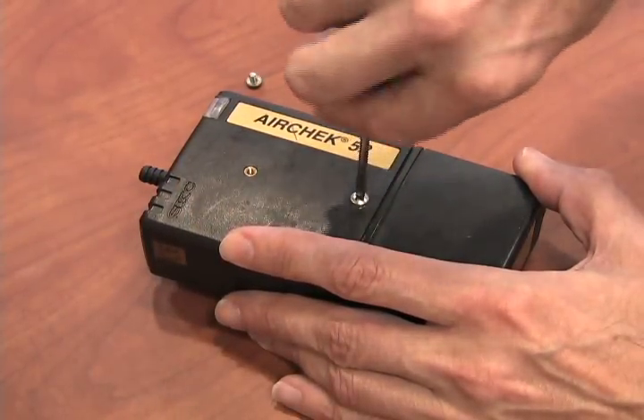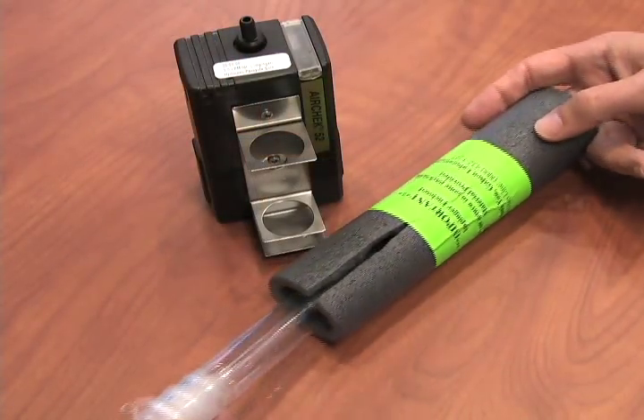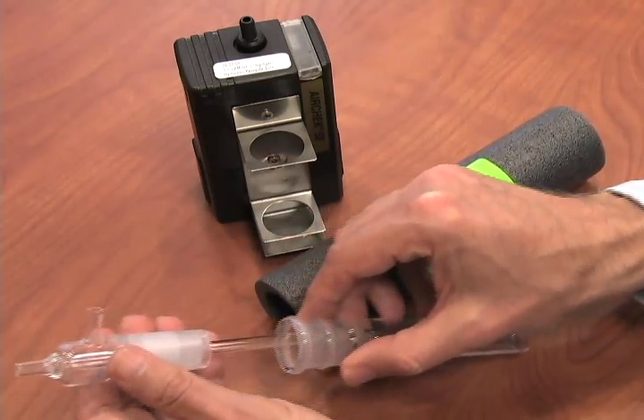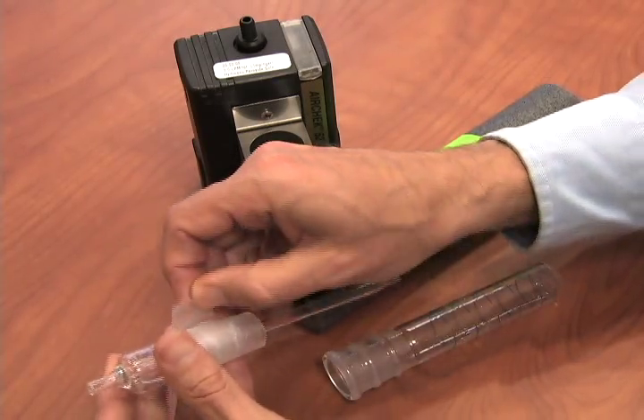Remove the two screws on the front of the pump and reinstall with the impinger holder in line. Remove the impinger from the foam packing material and save the material for return shipment. Separate the impinger and remove the paraffin wax from the top portion of the impinger that prevents the impinger from fusing together.